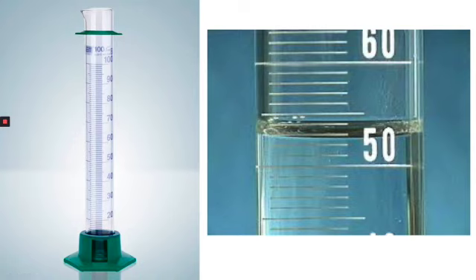Now for this example, I'm going to tell you the value is 1 milliliter each line, meaning 50 plus 1, 51, plus 1, 52, 53, 54, 55, 56, 57, 58, 59, 60. This one is pretty easy. I'm using it as my example, so when you see me go through the math, you can use it on a more difficult one.